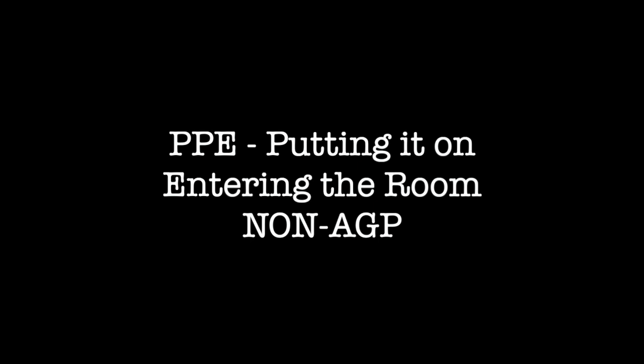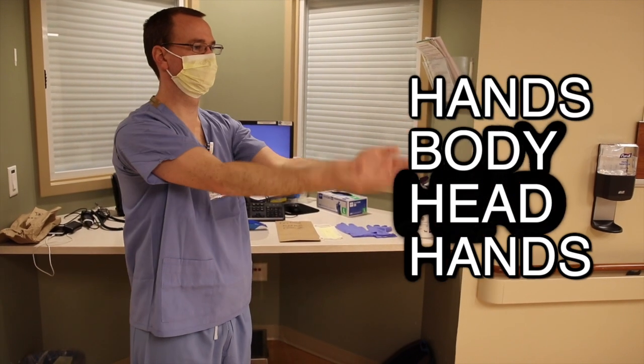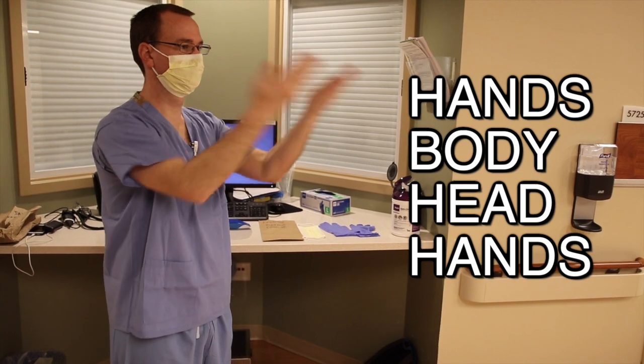Next, we will cover personal protective equipment, how to put it on properly and enter the room. This is in non-aerosol generating procedures. The instructions in this video are based on current CDC guidelines. Both putting on and removing personal protective equipment in the COVID patient follow this basic rule: hands, body, head, hands. That is, you start with your hands, you move to your body, you move to your head, and then back to your hands. Again, hands, body, head, hands.